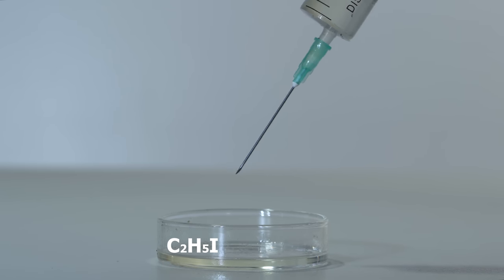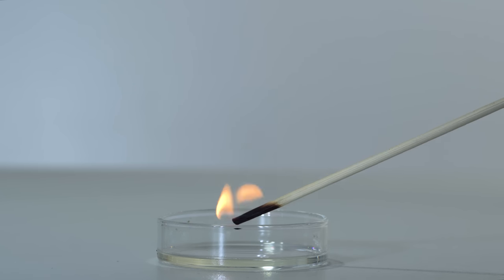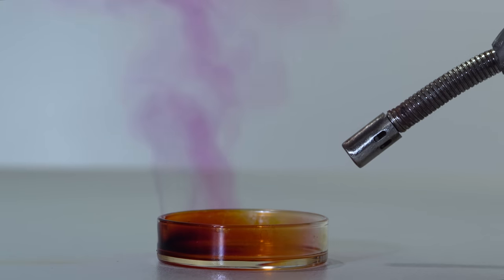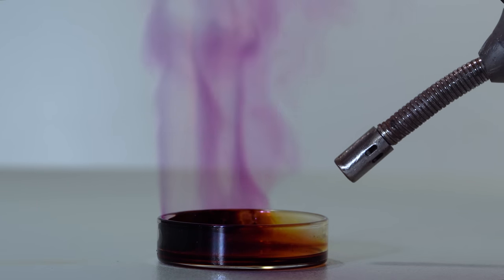The homologue of methyl iodide is ethyl iodide, which is also a hardly combustible liquid. Let's see what happens if we drop burning magnesium in ethyl iodide.